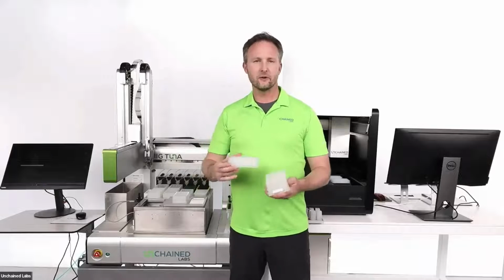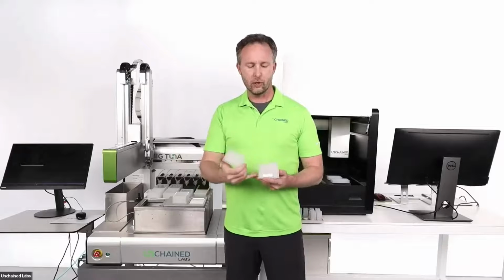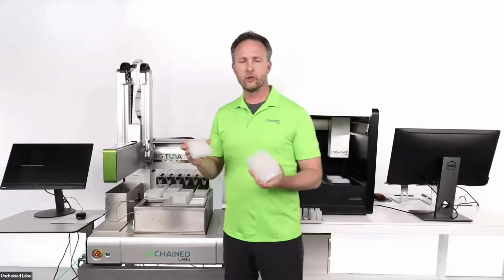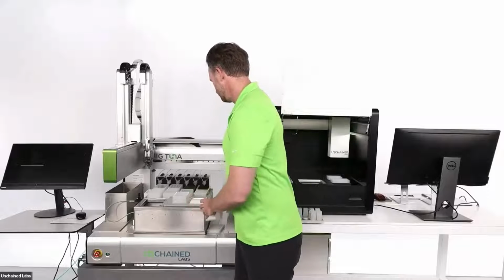We won't show you that here. This is kind of an easy-bake cooking show type demo, but essentially you can prep them with your buffer of choice or DI water or something like that, let them sit for a few minutes, and then they're ready for your samples to be put in there. So I'll show you that in a moment.